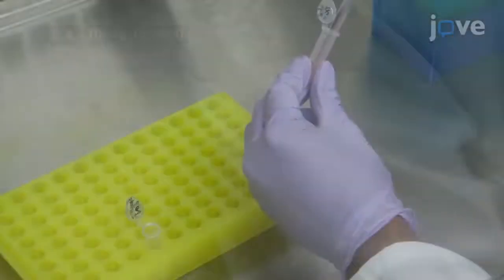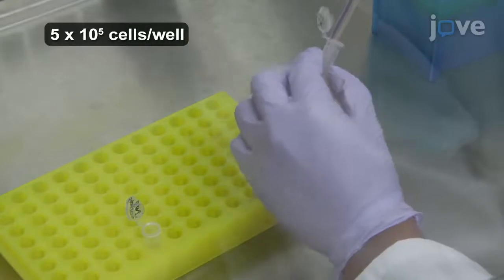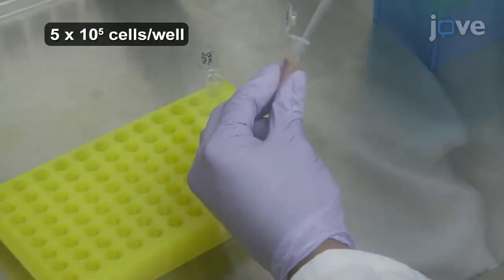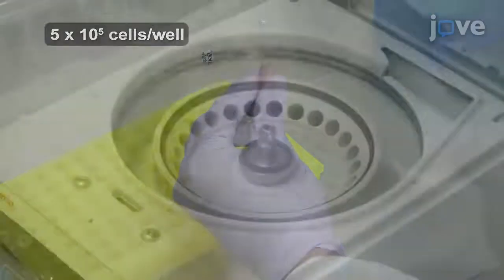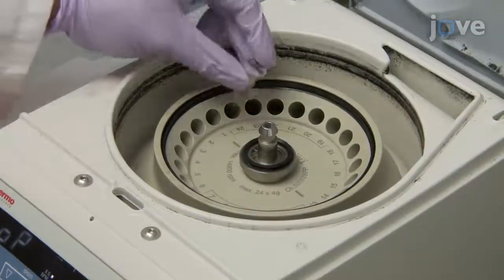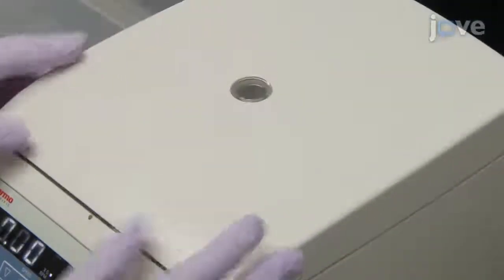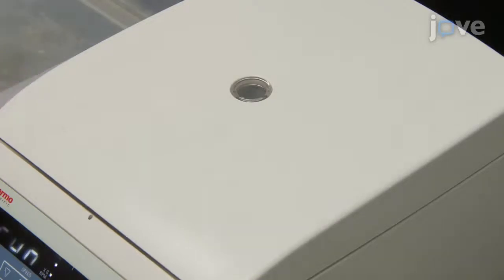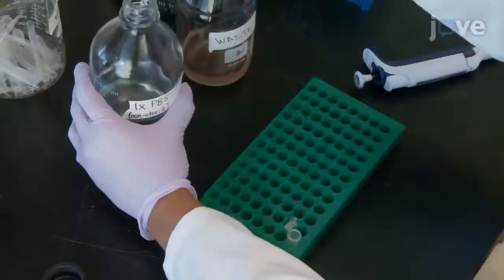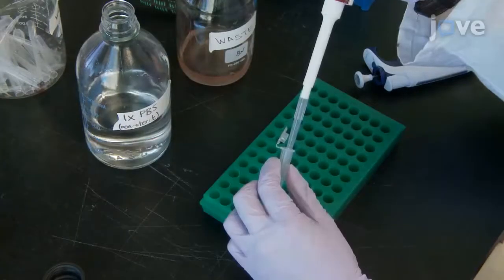Then transfer a sufficient quantity of apoptotic cells to a 1.5 mL microcentrifuge tube. Pellet the Jurkat cells via centrifugation at 500 times G for 5 minutes, then resuspend the cells in 500 µL of PBS.